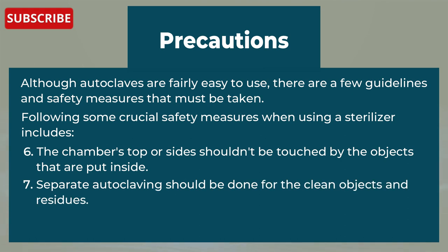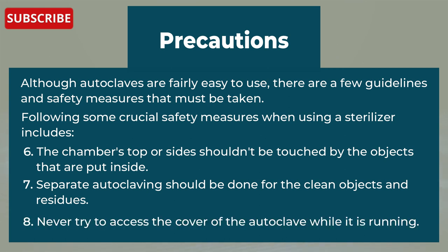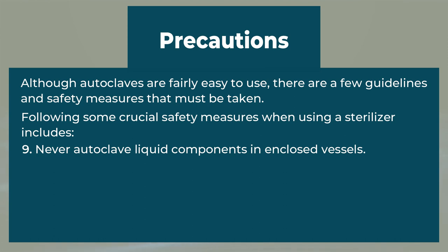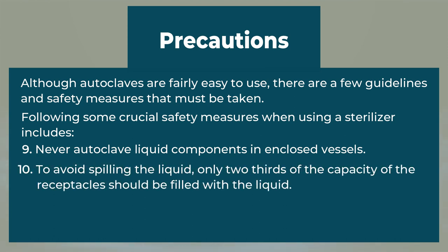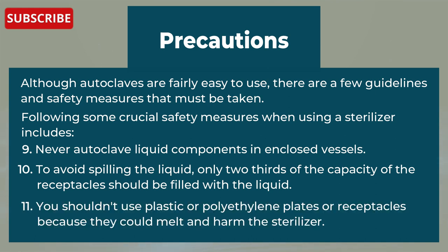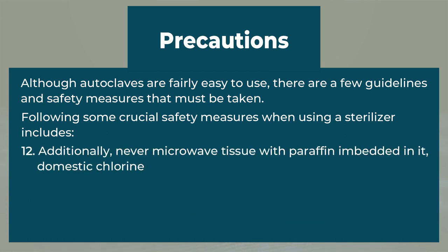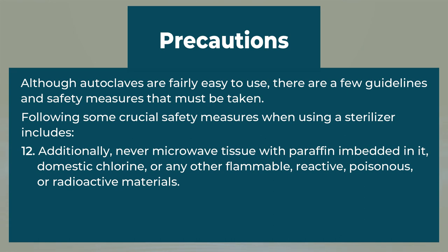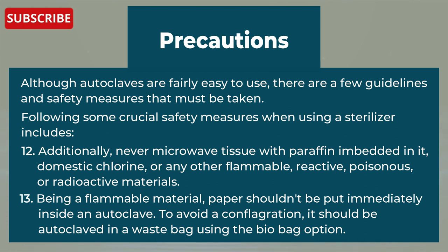Seventh, separate autoclaving should be done for clean objects and residues. Eighth, never try to open the cover of the autoclave while it is running. Ninth, never autoclave liquid components in enclosed vessels. Tenth, to avoid spilling, only two-thirds of the capacity of receptacles should be filled with liquid. Eleventh, do not use plastic or polyethylene plates or receptacles because they could melt and harm the sterilizer. Twelfth, never microwave tissue with paraffin embedded in it, domestic chlorine, or any other flammable, reactive, poisonous, or radioactive materials. Thirteenth, paper shouldn't be put directly inside an autoclave — being a flammable material, it should be autoclaved in a waste bag using a bio-bag option.